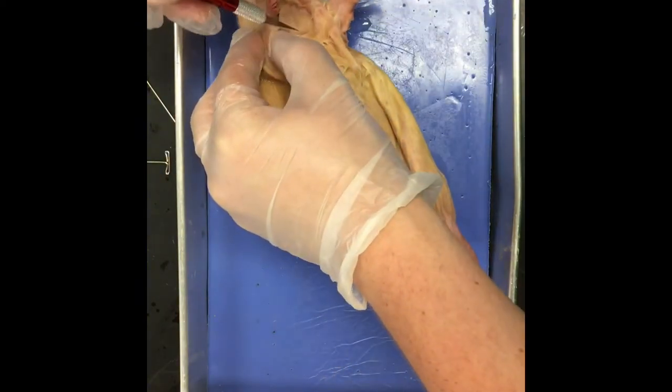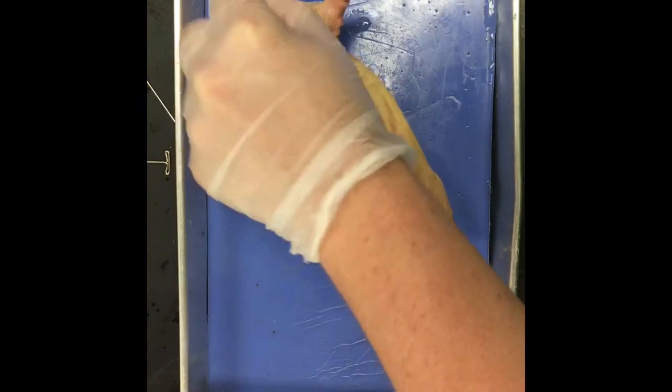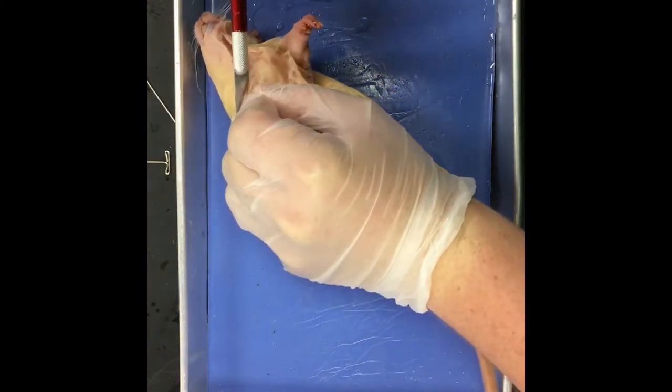Also, a little trick, most people use scalpels. If you use an X-Acto knife, it works really well for clearing away connective tissue.